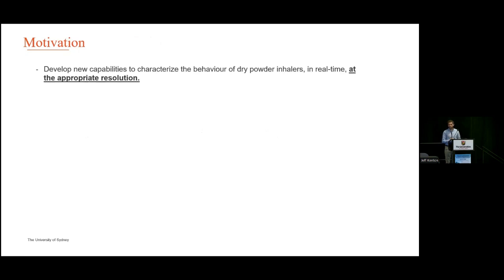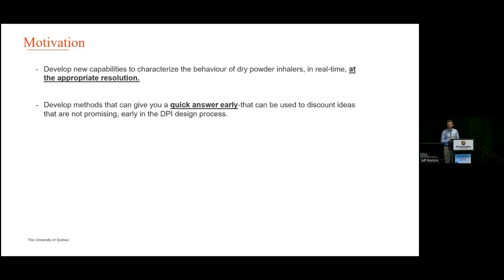So ultimately, the gap that we're trying to fill here, and Jag has commented on that already, is this dynamic issue. Aerosols are very, very dynamic, and we want to be able to get time-resolved and spatially resolved information on aerosols. Particularly in the context of DPIs, we want to be able to get measurements of what the particles are doing in the actual aerosol in situ, without having to sample it afterwards and influence the aerosol, so to speak. So that's one of the advantages of laser diagnostic techniques.